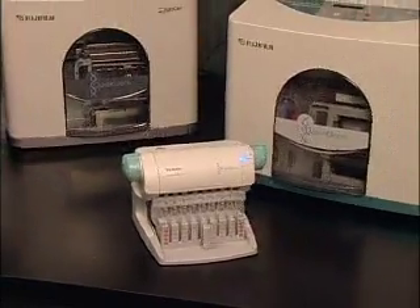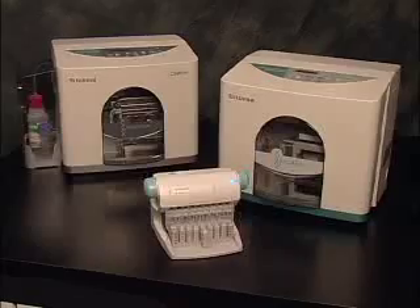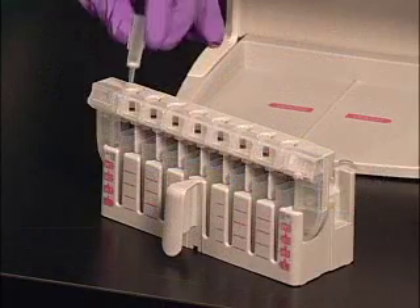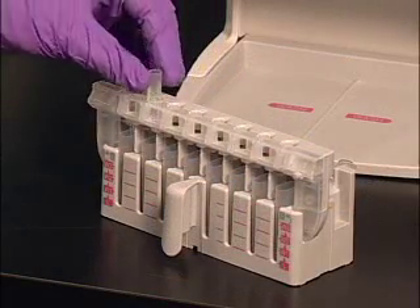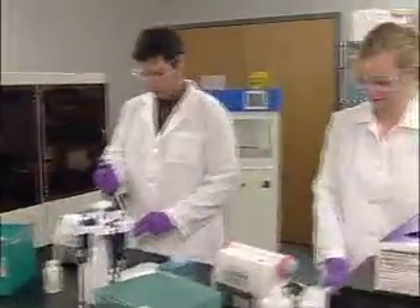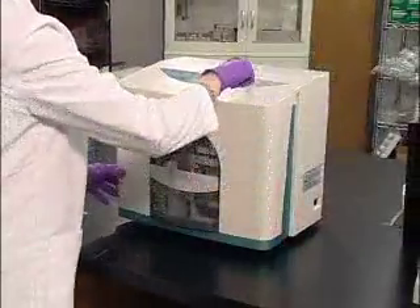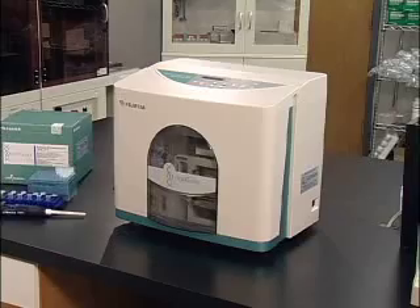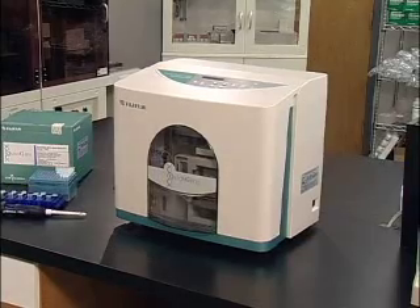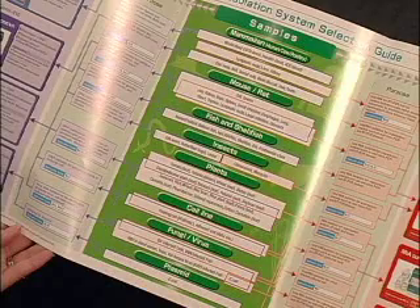The Quick Gene product line, developed by Fujifilm Life Sciences, features an innovative ultra-thin porous membrane technology for the isolation and purification of nucleic acids. DNA and RNA extraction with the Quick Gene series requires no centrifugation, enabling a faster extraction time compared to standard spin column extractions. Due to the outstanding binding capacity and elution efficiency of this 80 micron membrane, highly pure nucleic acids from a wide range of starting materials can be obtained in high yield quickly and easily.